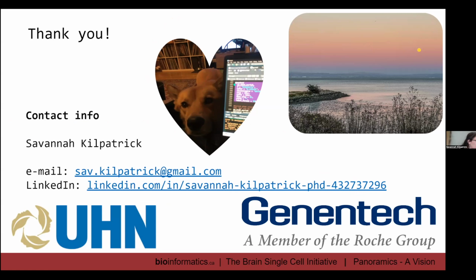Thanks, Savannah. We have a question online. If you find a transcriptomic signature associated with a disease in bulk RNA-seq, let's say using DESeq2, what would you do to represent the signature and quantify it on the Visium data, for example, per cell type?